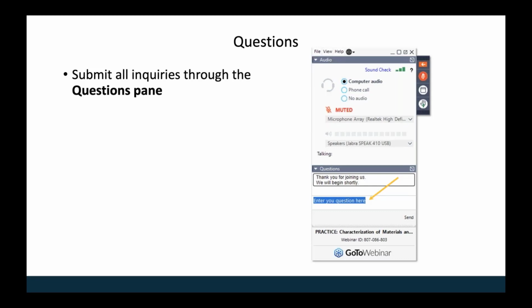I just don't think there's many. I mean, energy filtering is typically used in biological experiments for HRTEM, for example, on the standard Krios setup with the Selectris energy filter. I think energy filtering helps, but one of the advantages of the methods that Steph showed, the momentum resolved phase retrieval, is it's a lot more resilient to inelastic scattering. So I think Steph is correct. If it's really thick, there could be a lot of plasmons or charging, background artifacts, whatever, from the ice.